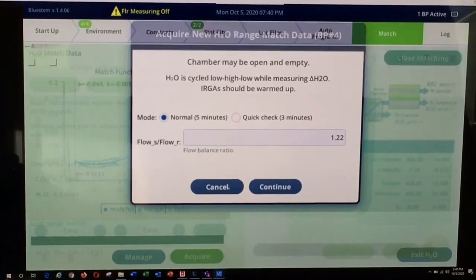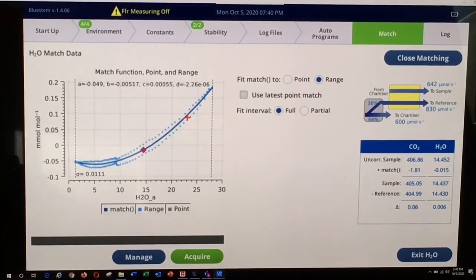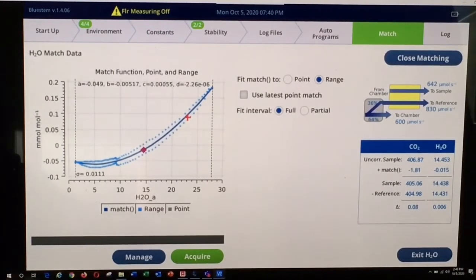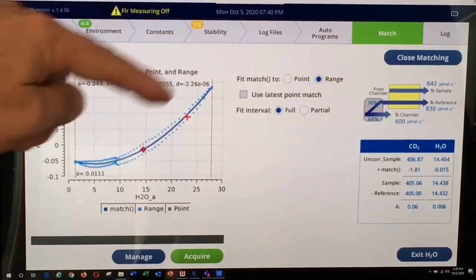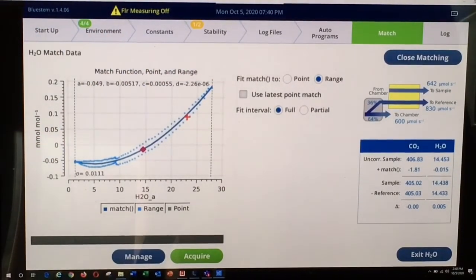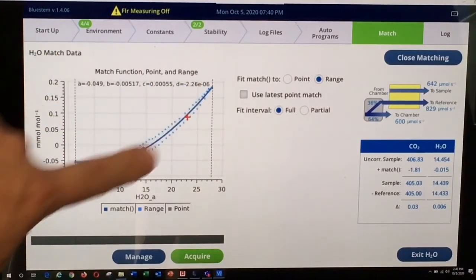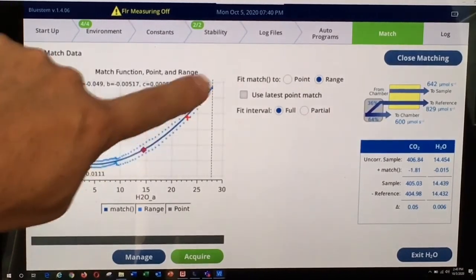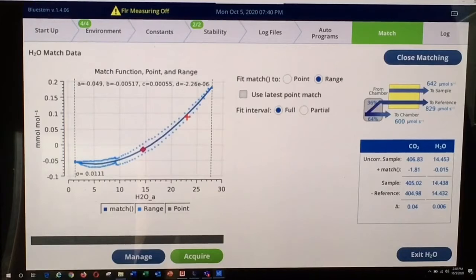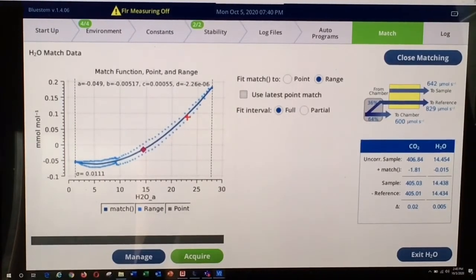I'm going to cancel out of that. The process, though, is identical: the instrument ramps water up from a low concentration to a high concentration and then back down to a low concentration, collects all of that data, and then fits a polynomial curve to the available data. That creates the basis for a water range match in the LI-6800.